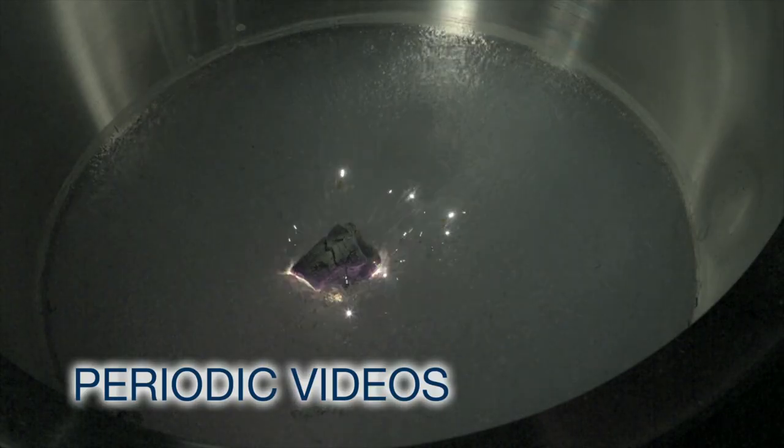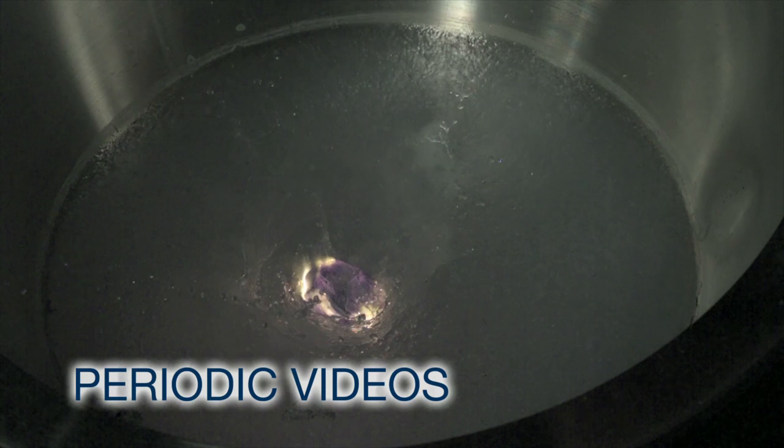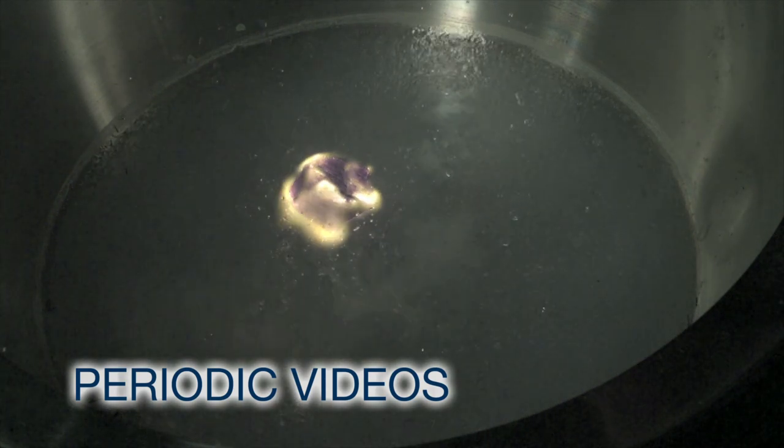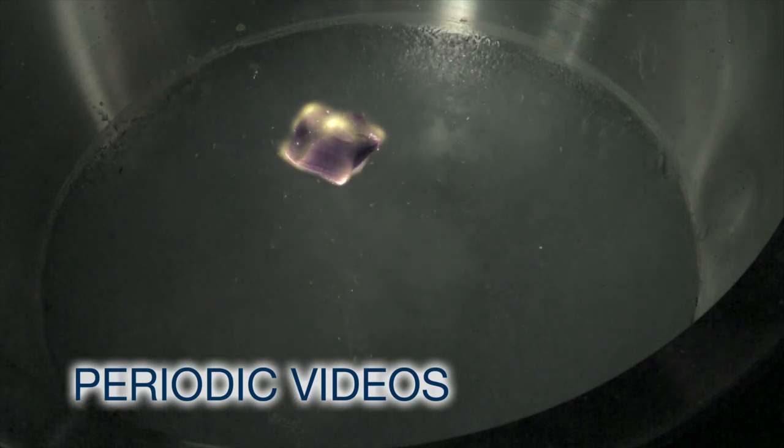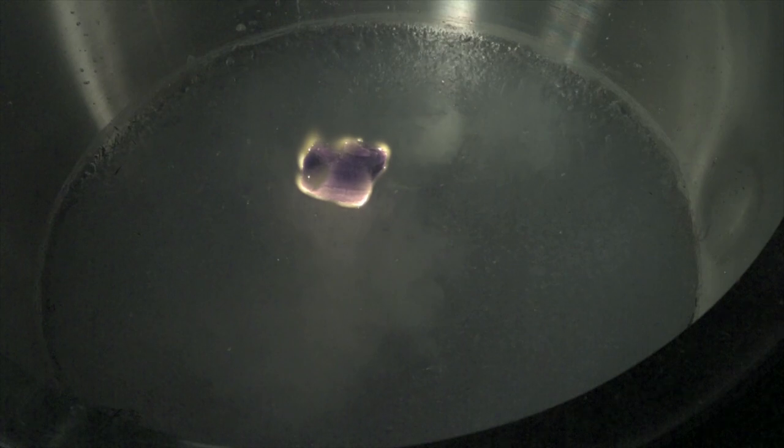One of Neil's favorite experiments, and mine, is dropping red hot charcoal into liquid oxygen in a cauldron, a bowl. You've seen it before, but now we're going to show it to you like you've never seen it.